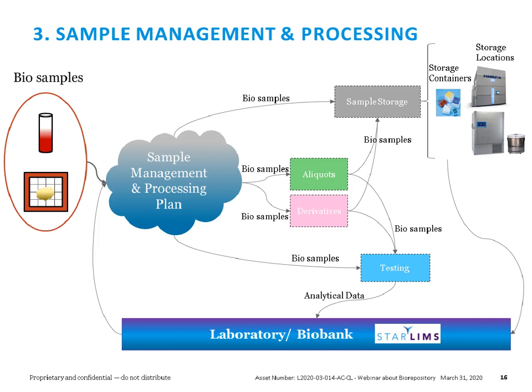Okay, now I'm going to go over the next workflow. Processing and sample management and processing is going to be the next thing. So let's say now we have our biological samples. Let's say we have them in the lab. They are stored, or they are perhaps in the benchtop.